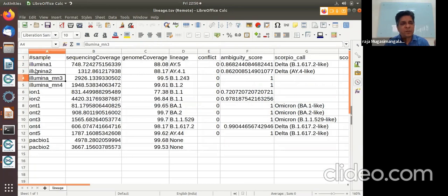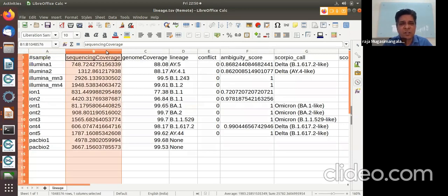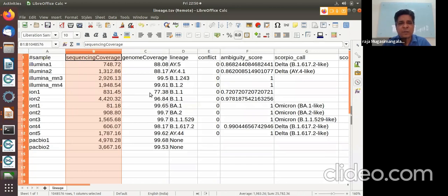As promised, these came from different platforms. These two are, by the way, MGI reads. Our folks didn't know. They were short reads. They put it at MN3, MN4 and all. These two are MGI reads. Today we got, I never analyzed it before, Ion reads. These are ONT, Oxford Nanopore reads. So you can see, I'm sorry, let me reduce this.